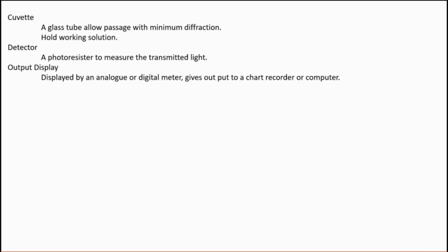We get a value, and that display is made on a digital meter, and we can record that reading sometimes in a chart, or we can record that reading in a computer. And one more thing, before we go on to find the concentration of a solution.